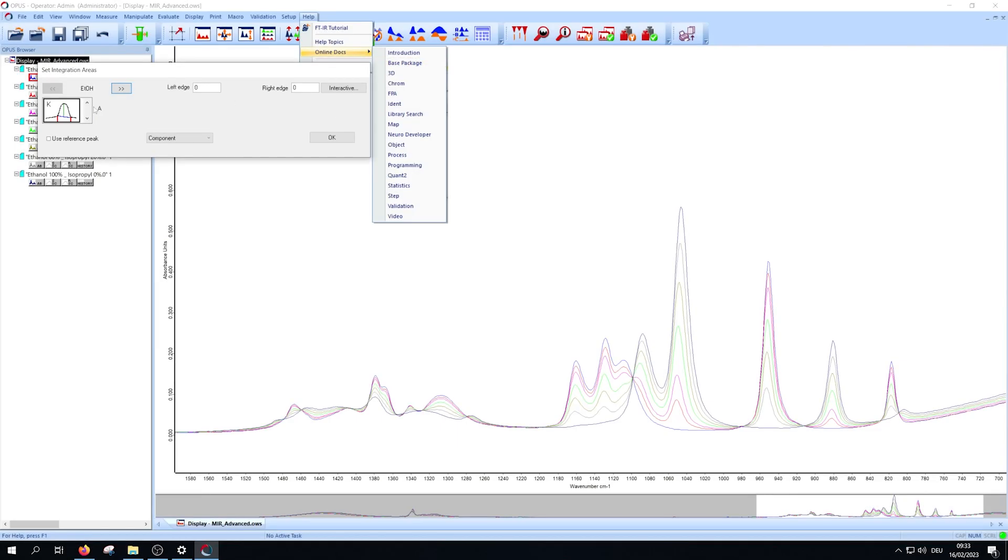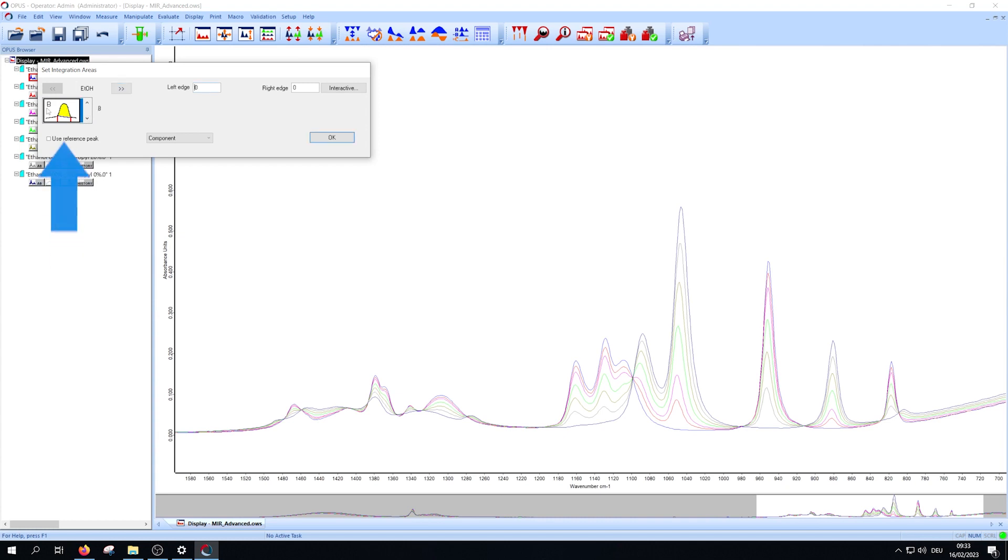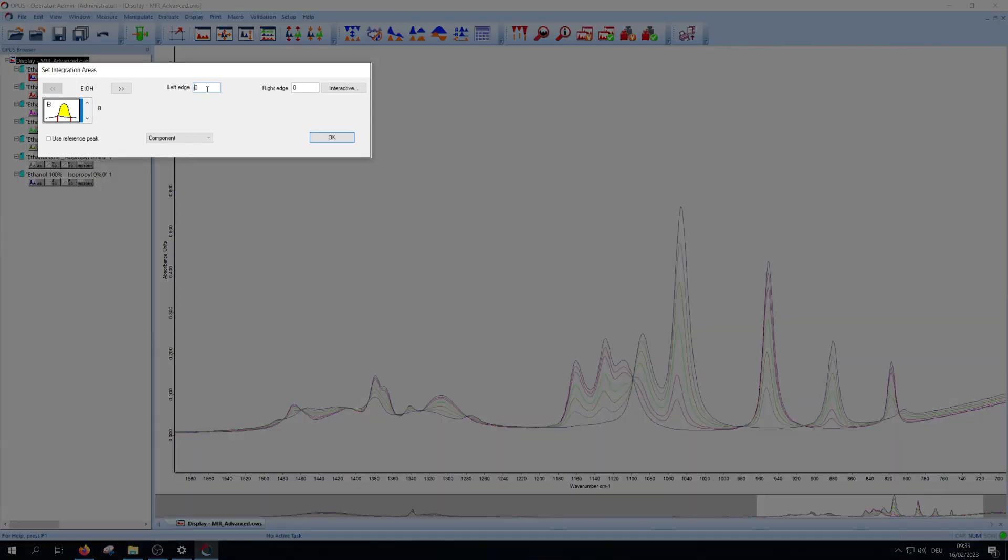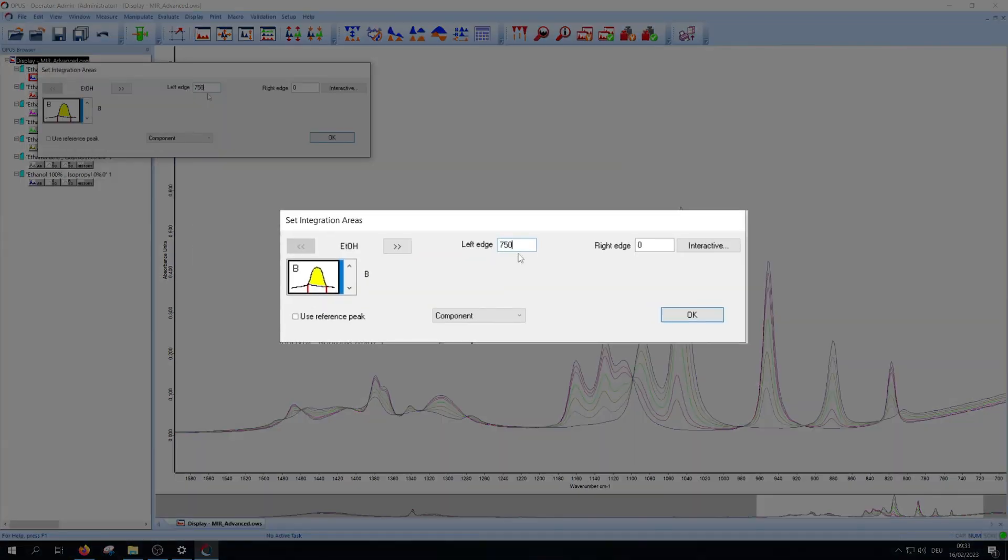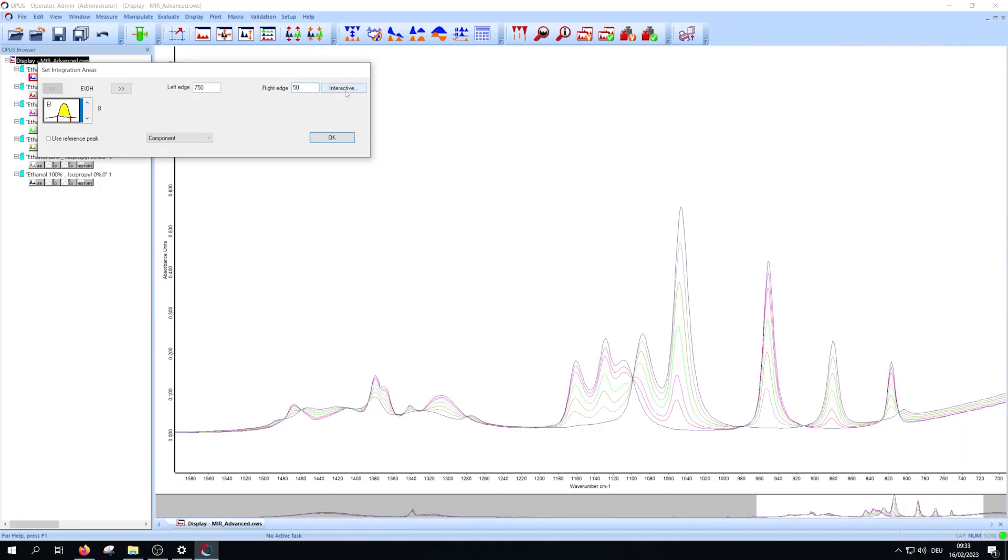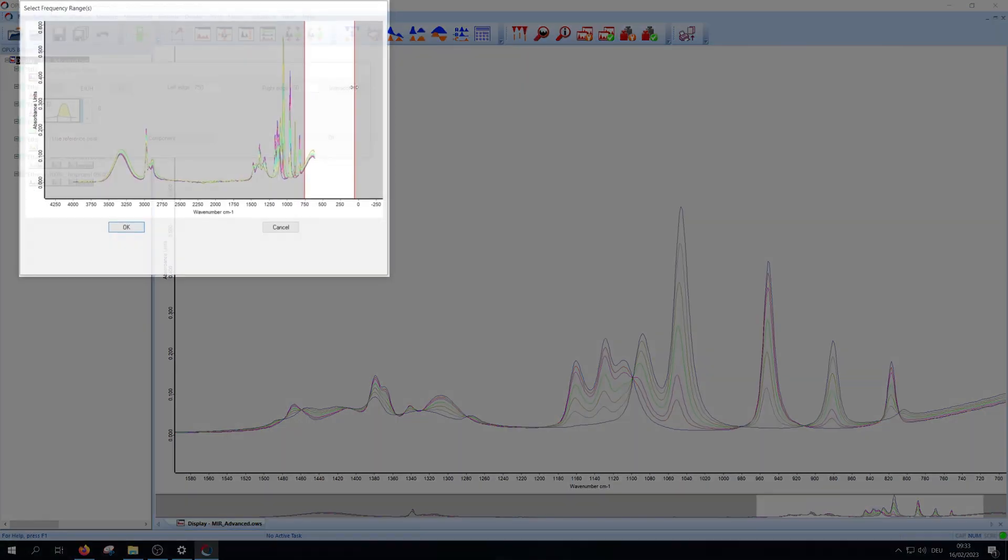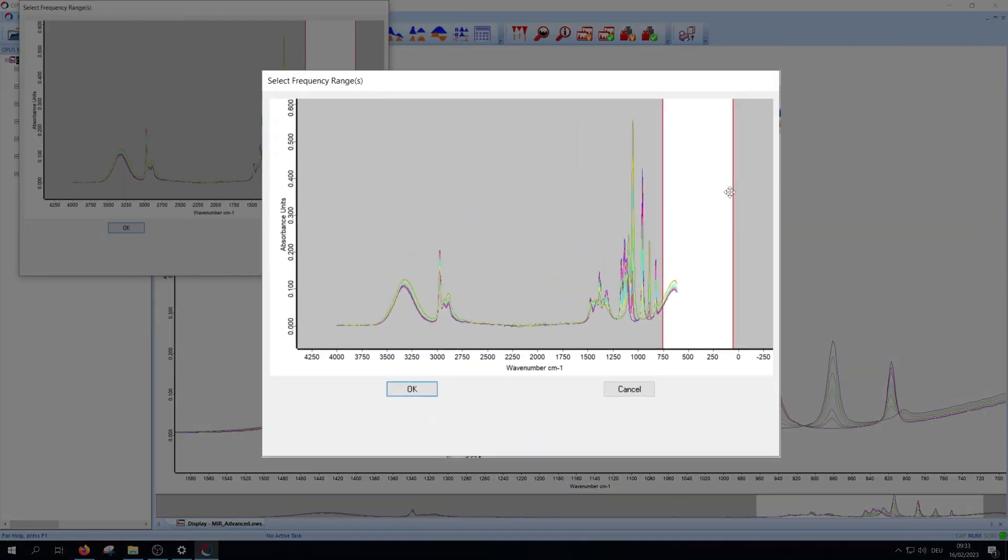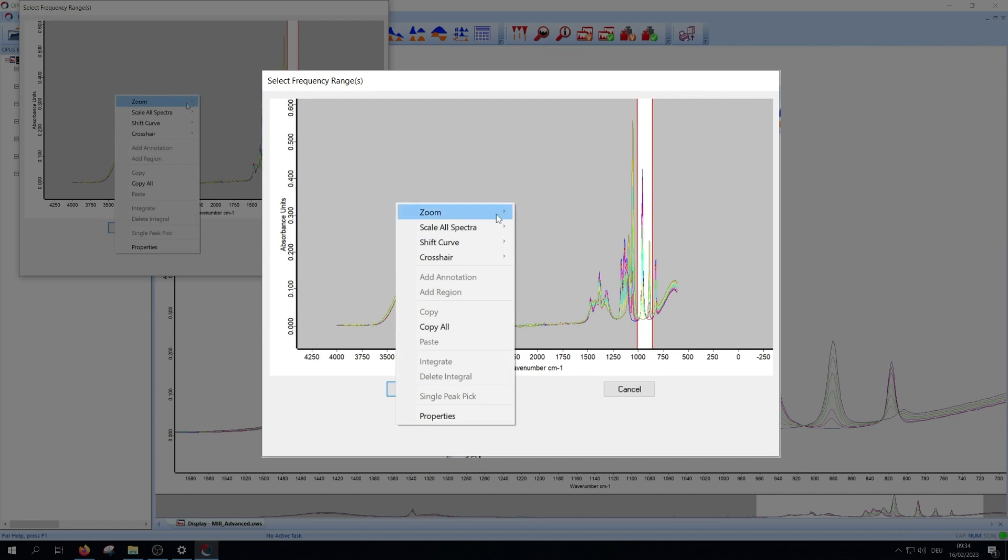We will use method B. Pay attention that you have to actively click on the icon until you see the selected method on the right. You can either directly enter the borders of the area or use the interactive function and move the borders manually. Just pre-select the range then left click in the gray area.